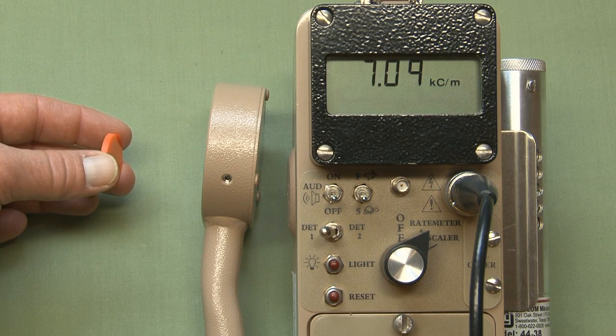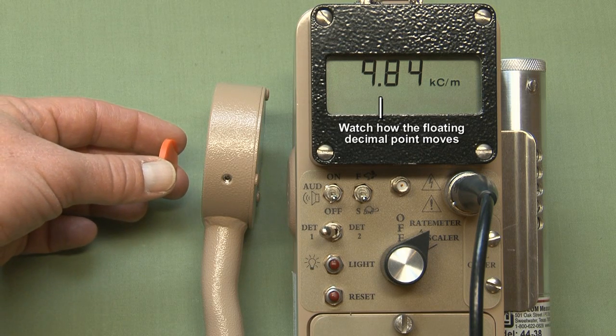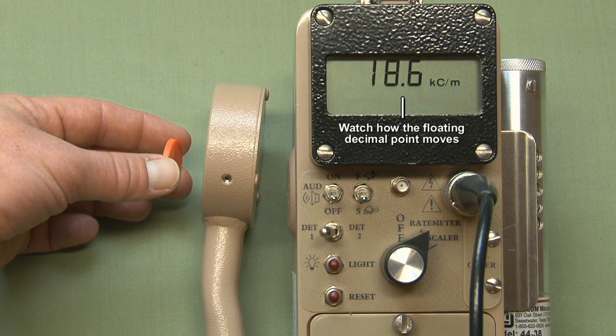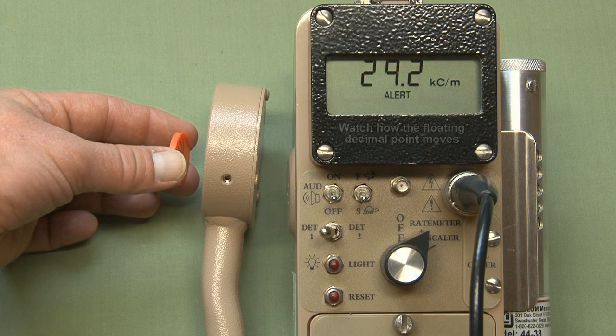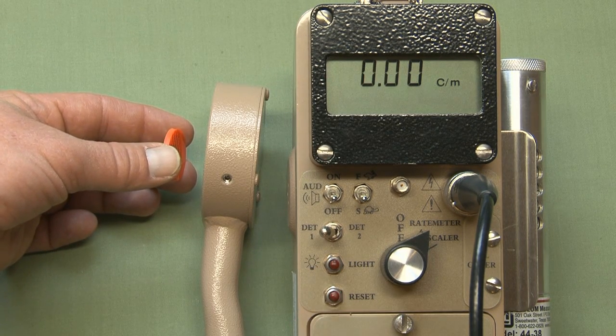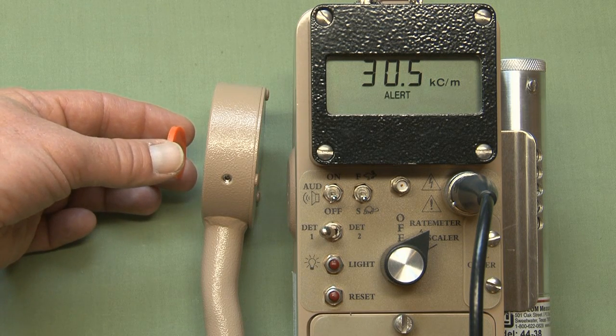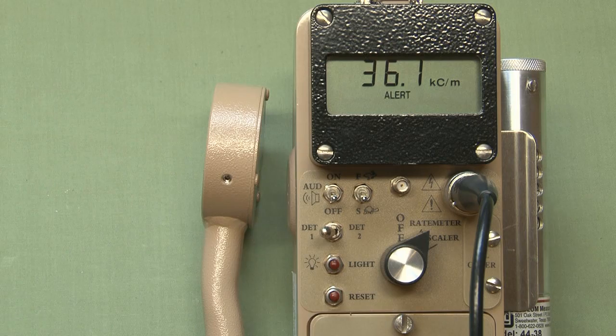If I go up a little more, we should see the alert come on so you can see what that alert screen looks like. If I hit the reset button, it'll reset out and clear the alarm, but since the source is still there, the alert stays in place.